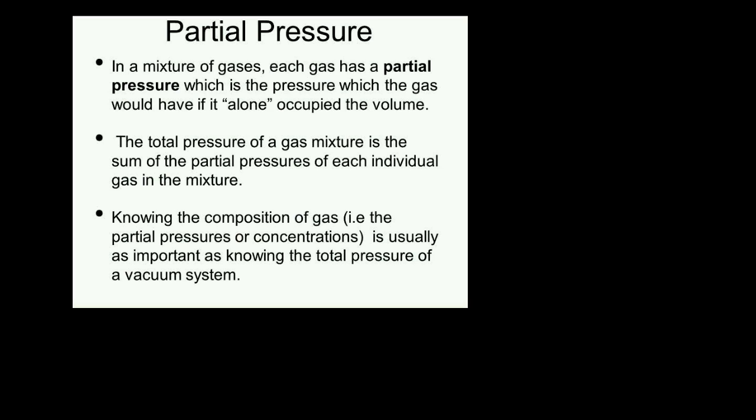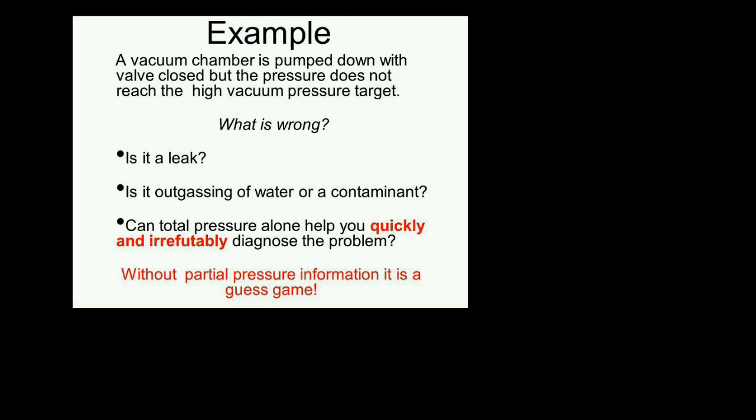Very often, many of us rely on a total pressure reading to know where our vacuum system is. However, in cases where we are pumping down a vacuum system, very often knowing what's left in that vacuum system, what the residual gases are, is just as important as knowing what the total pressure of that system is.